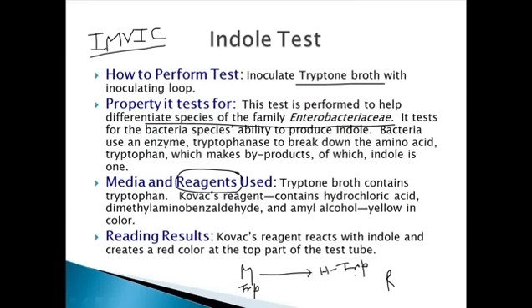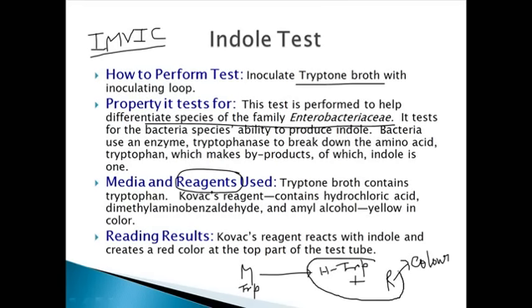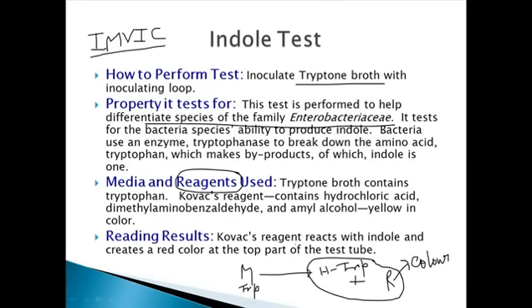That reagent is going to react with the product of the reaction, and finally give us a coloration most of the time. Because if we see the coloration, we can determine yes, the reaction is taking place, and we can confirm that our substrate is hydrolyzed to this hydrolyzed form, because the coloration can only take place when the hydrolyzed form reacts with the reagent. That's why we have to add reagents in all these reactions.